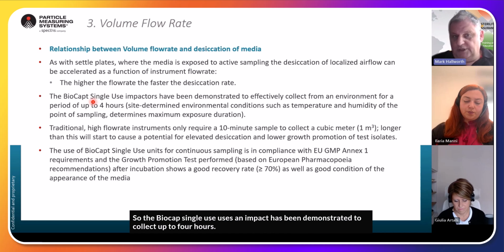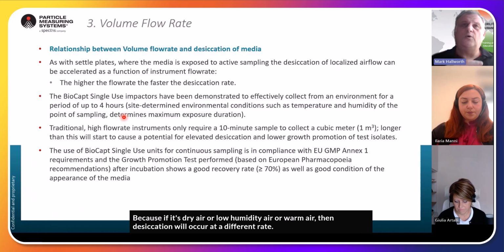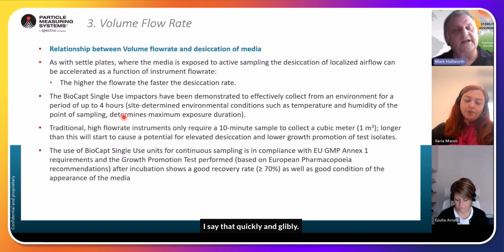So the BioCap single use impactor has been demonstrated to collect up to 4 hours. And again, that's a site determined environmental condition, because if it's dry air or low humidity air or warm air, then desiccation will occur at a different rate. So you just need to go through some site validation. I say that quickly and glibly. There's a process in doing that.